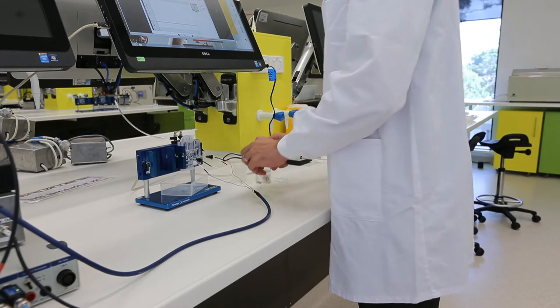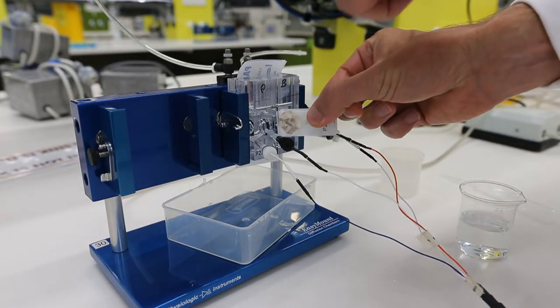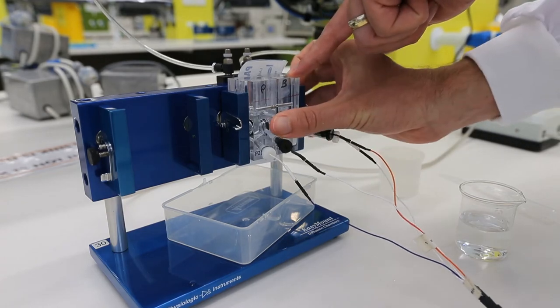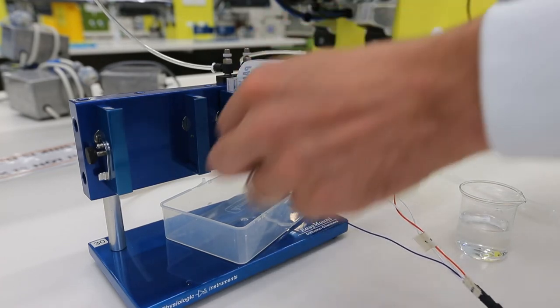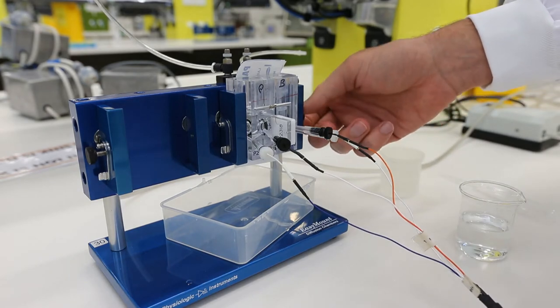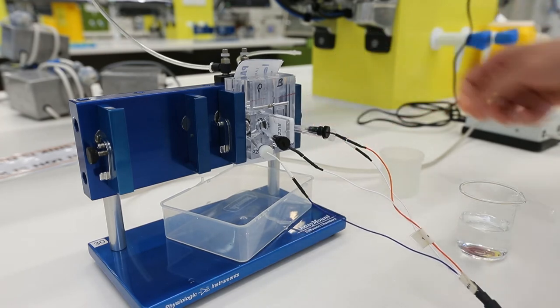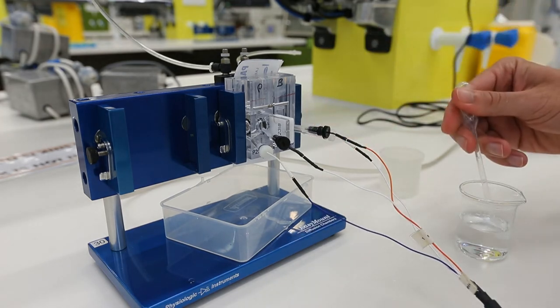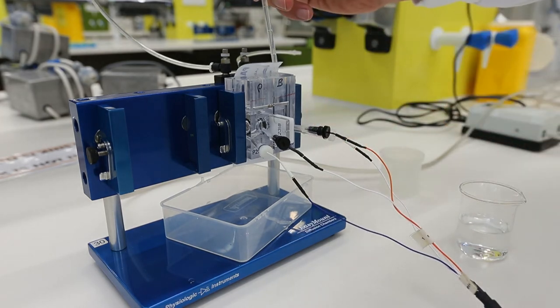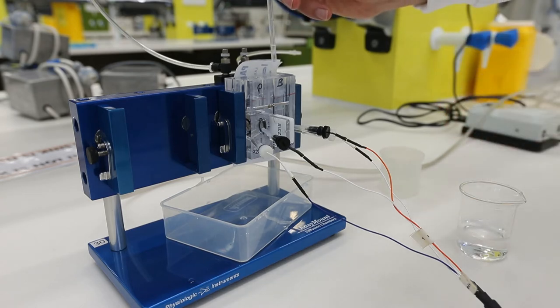Take your tissue holder and place it into the Ussing chamber, again making sure that the clear perspex layer of the tissue holder is facing left. Drop the locking arms and tighten the frame using the knob on the side. Then refill the chamber to the red fill line using normal Ringer's solution.